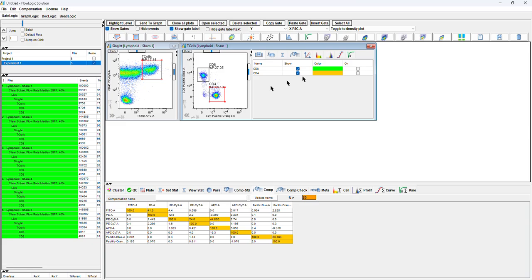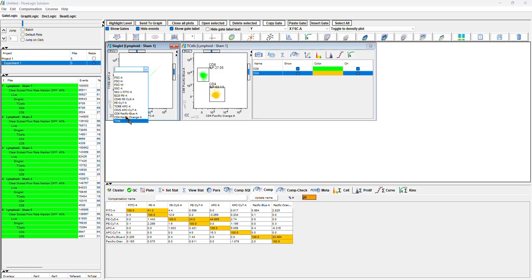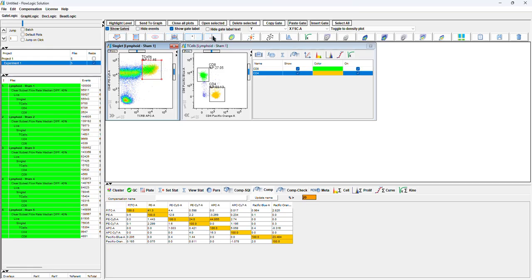After we did this, we can get our data, and we can even visualize the gating only. You can see that this is removing all the data around, and you can visualize just the gating. So it's quite useful. We have various functionality here: show gate, show label, hide just the text or the label. Here we already show the rest, but on selecting, you can toggle all the plots.